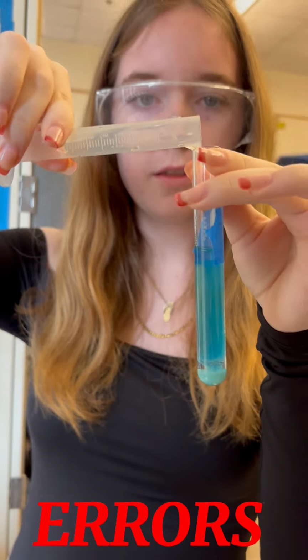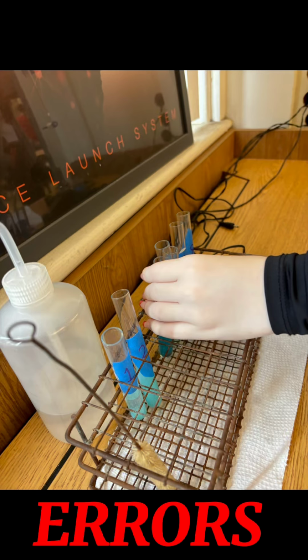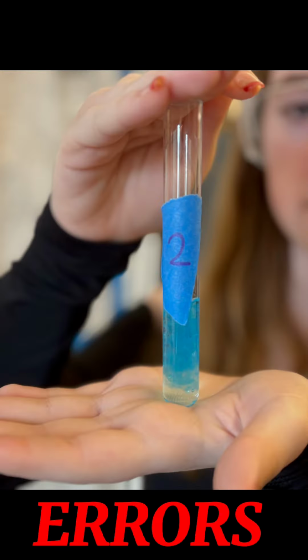Some of the mistakes we made that could have led to error within the experiment were that in test tube 5, we didn't add enough distilled water, meaning that not all of the test tubes were exactly the same level, which could have negatively affected the amount of precipitate that was made. In our first experiment, we also did not mix enough, nor did we wait enough time to see clear results, so the numbers you saw before were from our second trial.